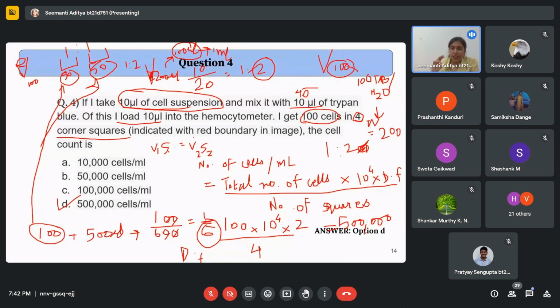So basically, when we are plating in a 96 well plate or 48 well plate, we have to always mix the cells well in the Eppendorf tube or in the Falcon tubes properly before aliquoting it, because after aliquoting, you cannot mix it in the 96 well plate. But for bigger dishes, 35 dishes or 60 or T25 flasks, the surface area is big, so we don't need to resuspend this 100 microliter in 1 ml of media and then put it, because you can put it directly in that flask. That flask will already have the standard amount of media.